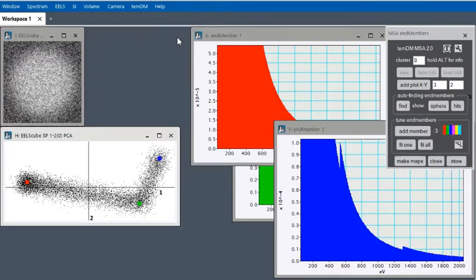We close this scatter plot and look into another option. You probably notice that this endmembering process generates a lot of windows. So many that it's not easy to manage the allocation in the working space. There is some option helping you.